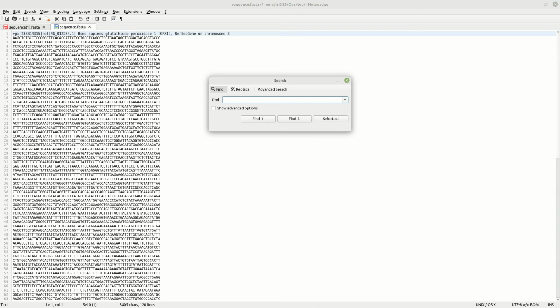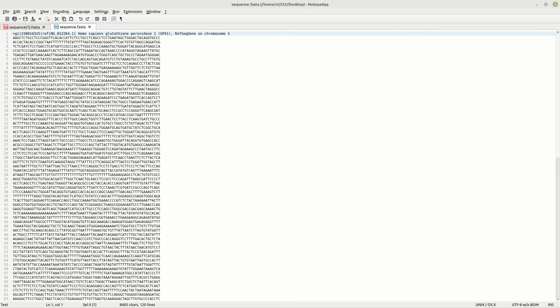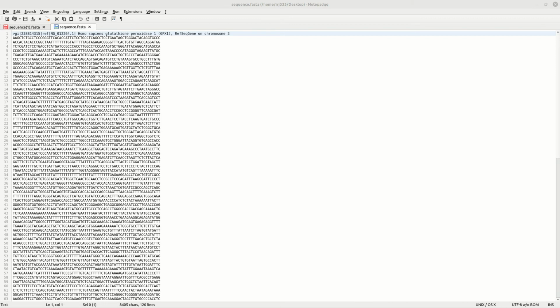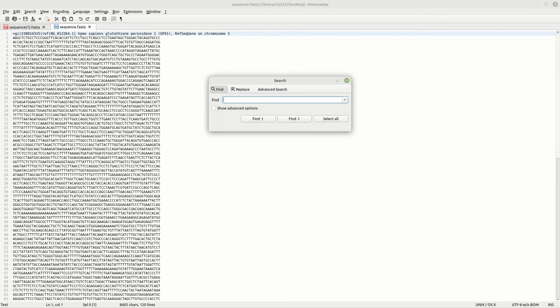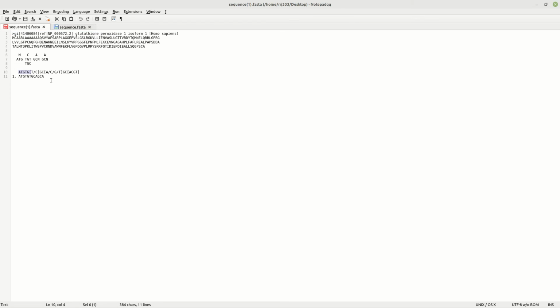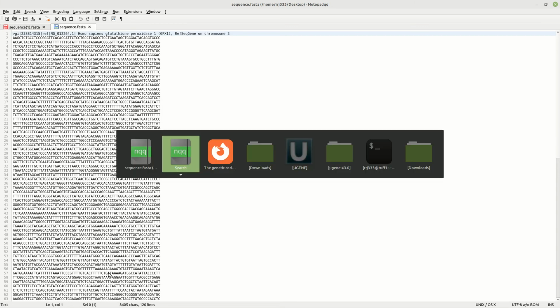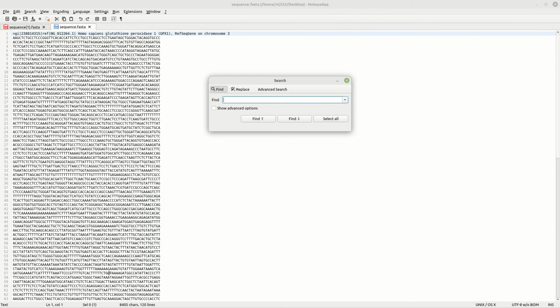And so what was the sequence we needed to find? Let me go back. Oh, it's up here. I have it. It's this one. Alright, we need ATGTG. ATGTG. There we go.